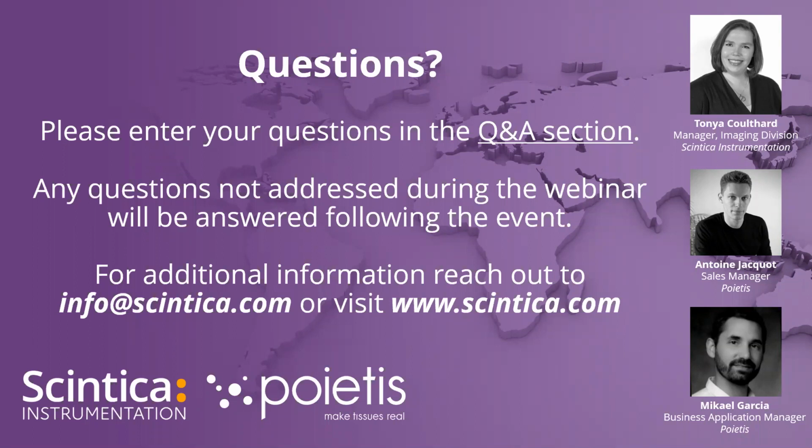You would have previously printed something soft or something that's not going to damage the cells, such as collagen, for them to adhere to and not be damaged as they move towards the surface. But the traditional shear stress and pressure that's required with normal bioprinting isn't in play with the laser side of things. So there's reduced stress on the cells. There's less complication in terms of the media or the material or the bioink that you need to formulate to try to reduce that. And therefore the viability increases as well.